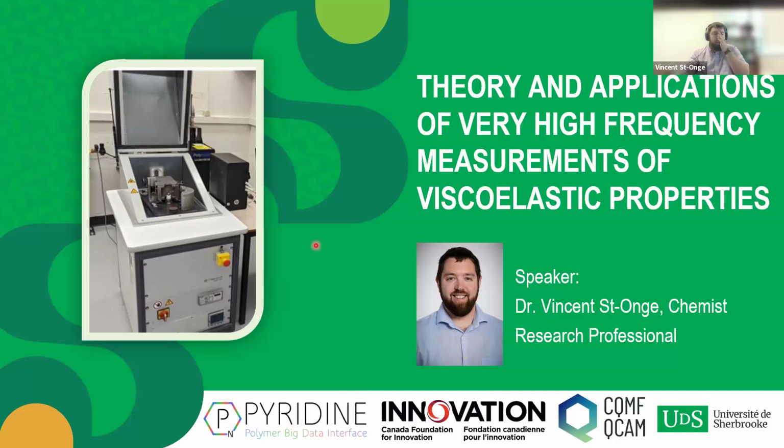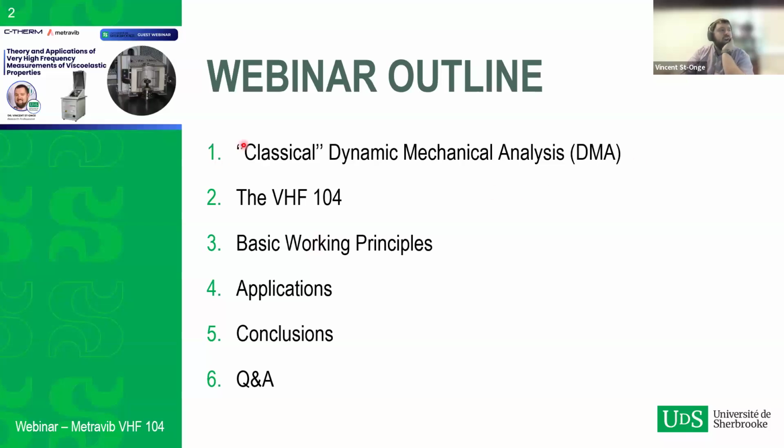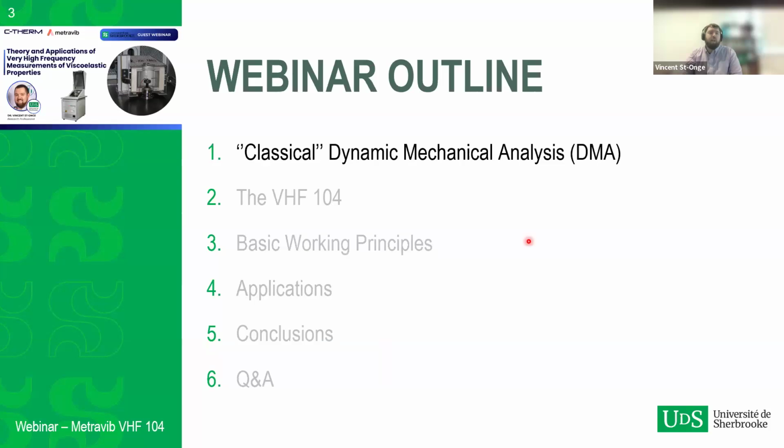My plan for today is to start with the classical dynamic mechanical analysis to set the basis, and then move on to the VHF 104 and see how this instrument compares to classical DMA instruments. Then we're going to go into more details about how it's actually working and how the analysis behaves, a few quick applications to wrap things up, and then the question and answers period afterwards. So let's start with the classical DMA section.